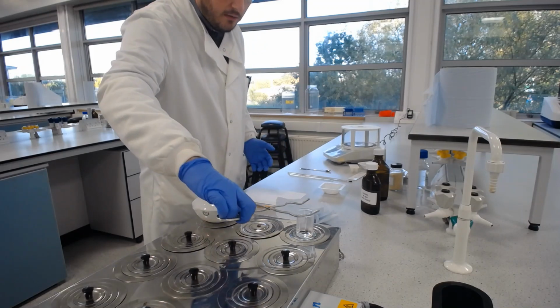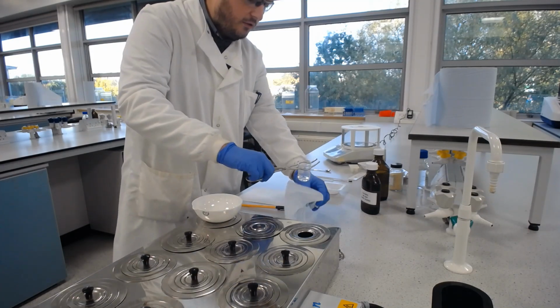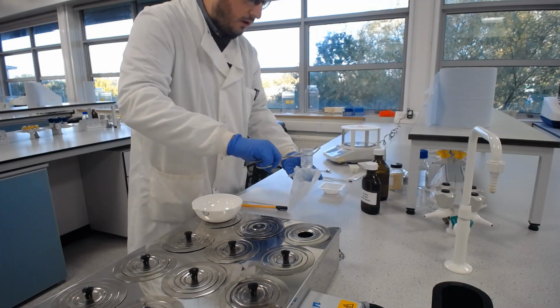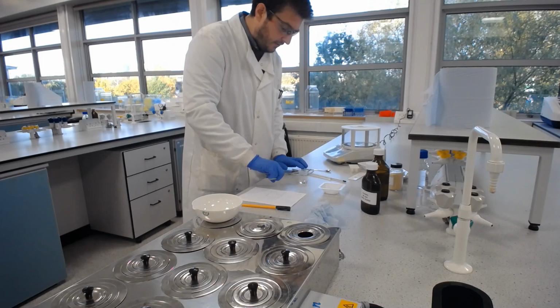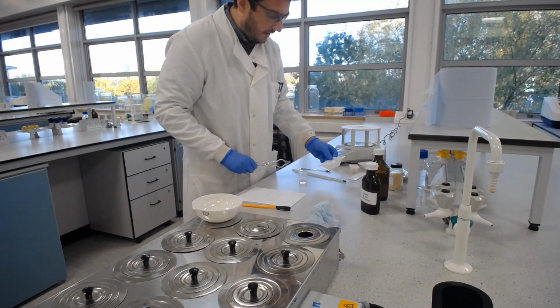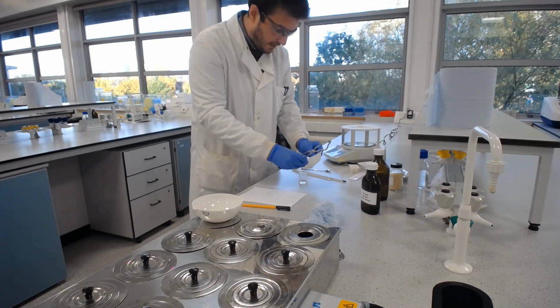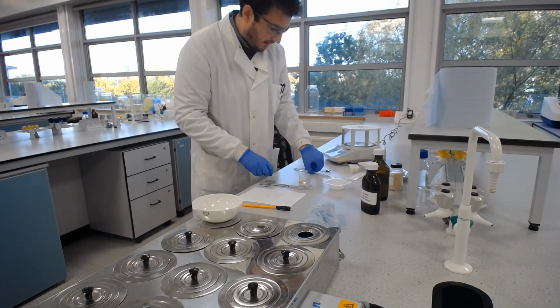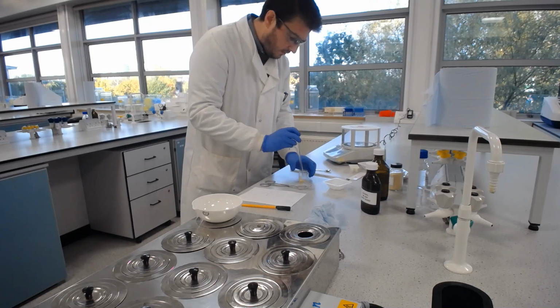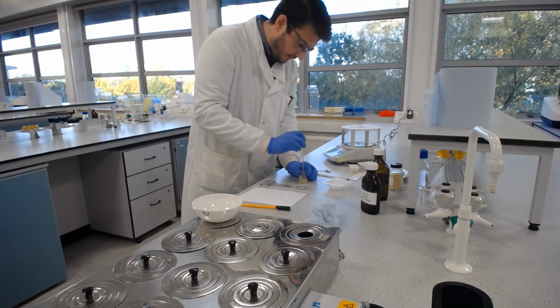So I'm going to take the water off of the water bath. Now I've only just weighed this, remember, so we know we've still got an excess of water, which will help to get this gelatin into suspension so that you can actually, when it cools down, make a gel again, which is what we need. So I'm going to pour that directly in. Now this temperature will be dropping the whole time, so we want to work relatively quickly.